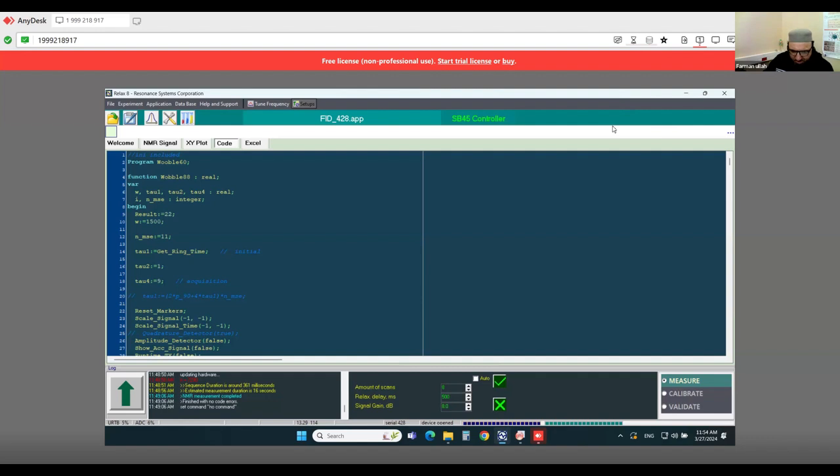Maybe if the lower is helpful, we can also produce. So these are some things which I deliver to you: the parameters, the cycles, and the way, if you are not getting a good result, you will change these things.